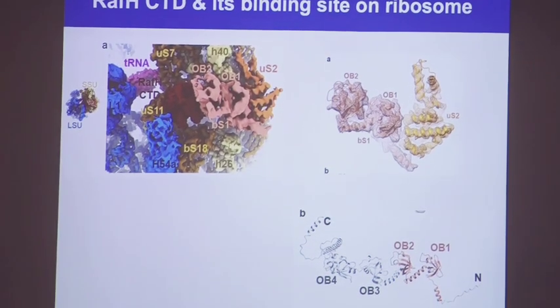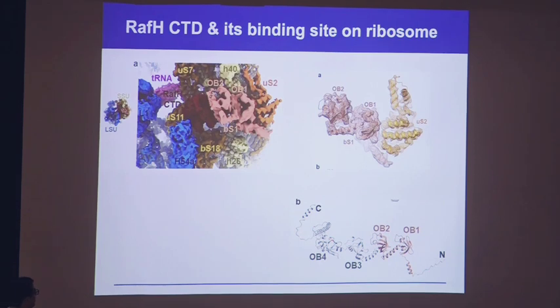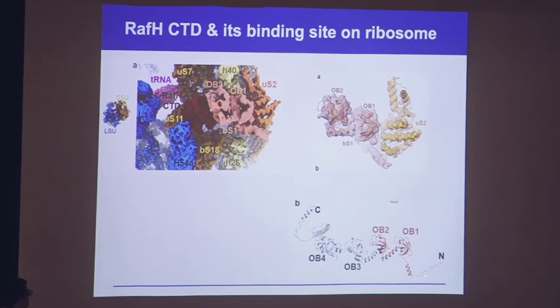So essentially, this is what we got from AlphaFold. Obviously these two domains were matching, and we docked them in here. The other parts, it means they are disordered. So it is just for the docking, AlphaFold.